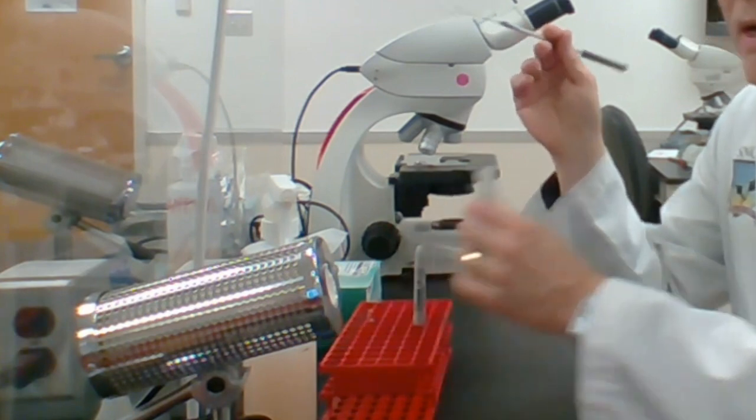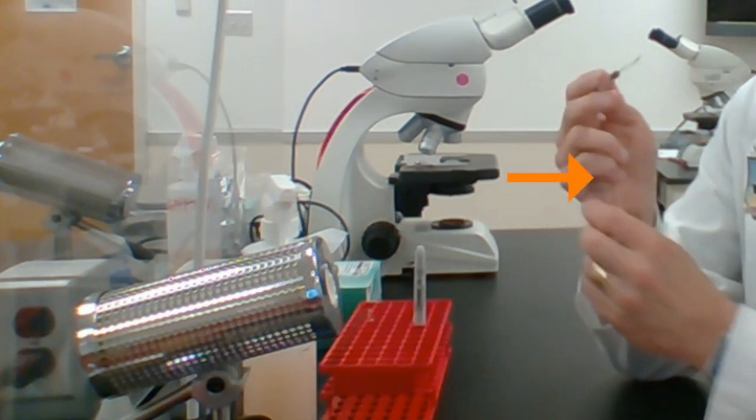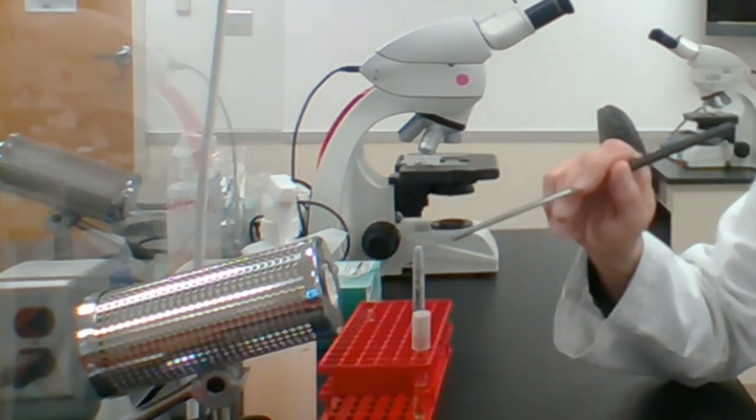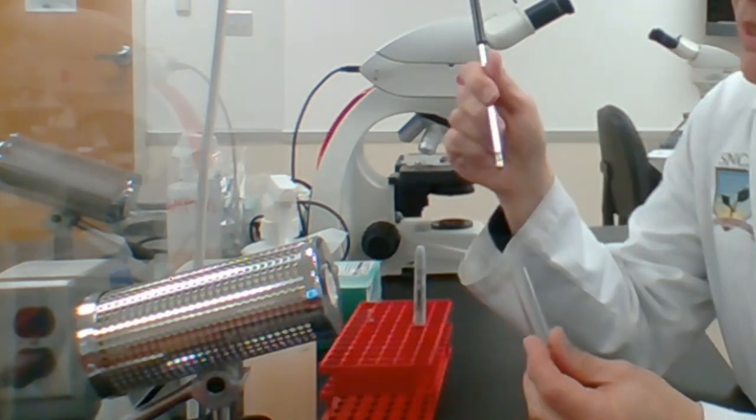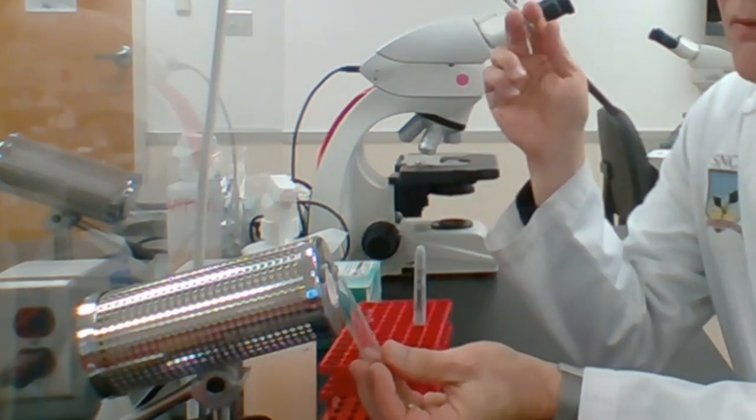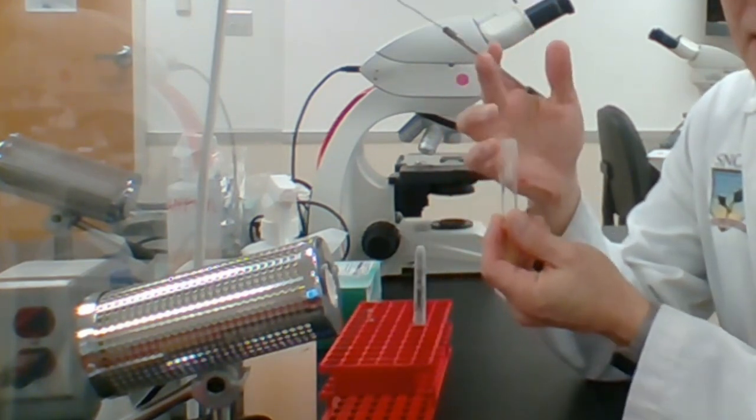The cap is removed from the tube by the pinky of the dominant hand and the mouth of the tube is flamed. The transfer tool is sterilized and placed into the tube to pick up bacteria. Then the tube is flamed again and the cap replaced before it is set back in the rack.